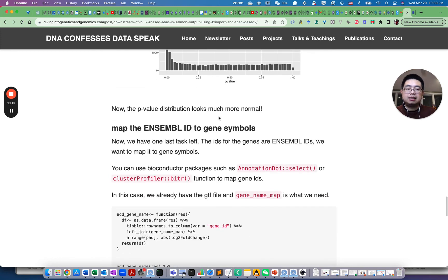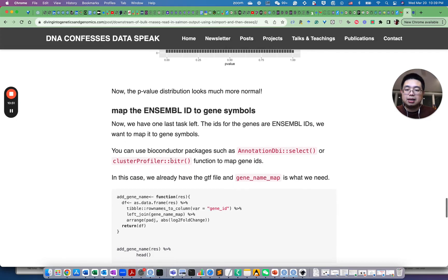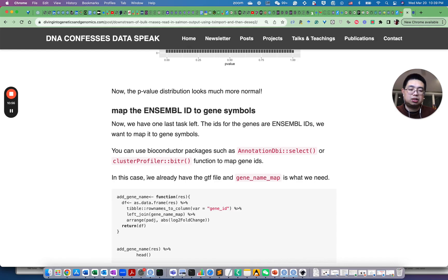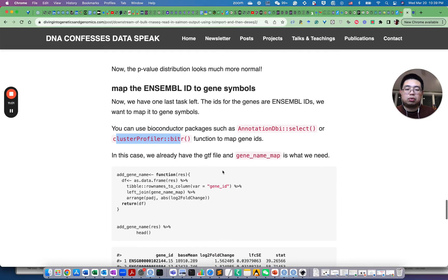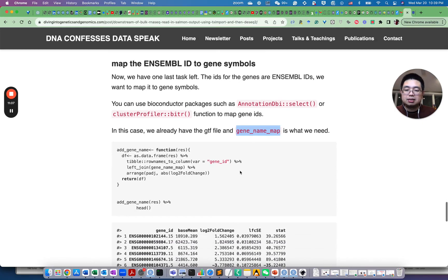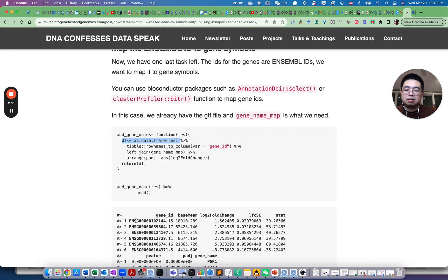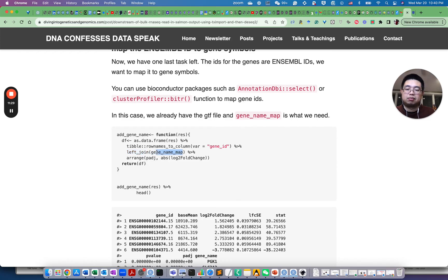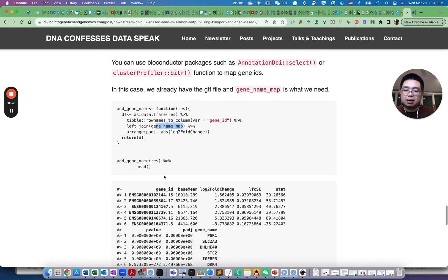And then we have the last task to do because the gene ID, Ensembl ID, we want to map it to gene symbols. So of course, we can use Bioconductor packages such as AnnotationDbi select function or the clusterProfiler bitr function to map gene IDs. But in this case, we already prepared this gene name map file from the GTF file, if you remember. So I just made a small function here. Convert that results object to a data frame and then put this row names into a new column called gene ID. And then I left join with that gene name mapping file that we got from the GTF file. And then return the data frame.